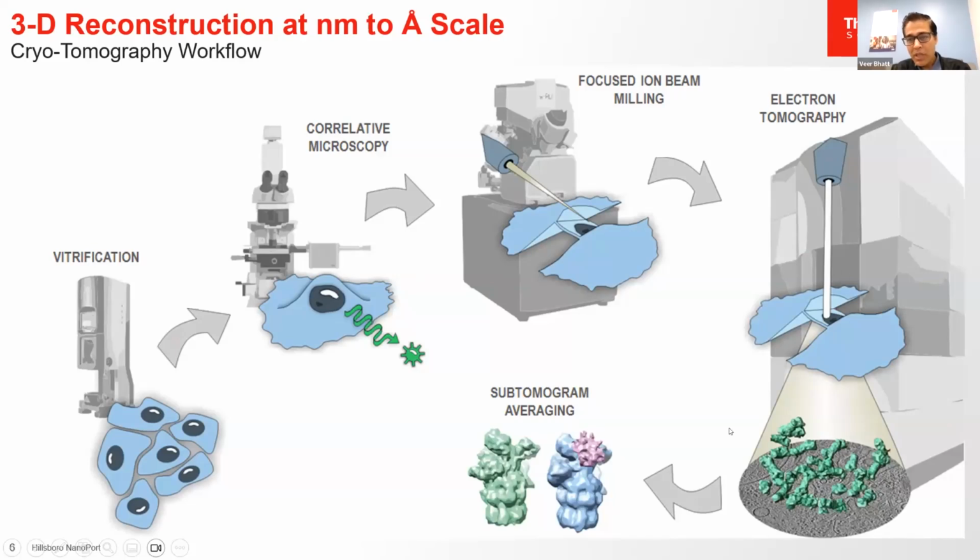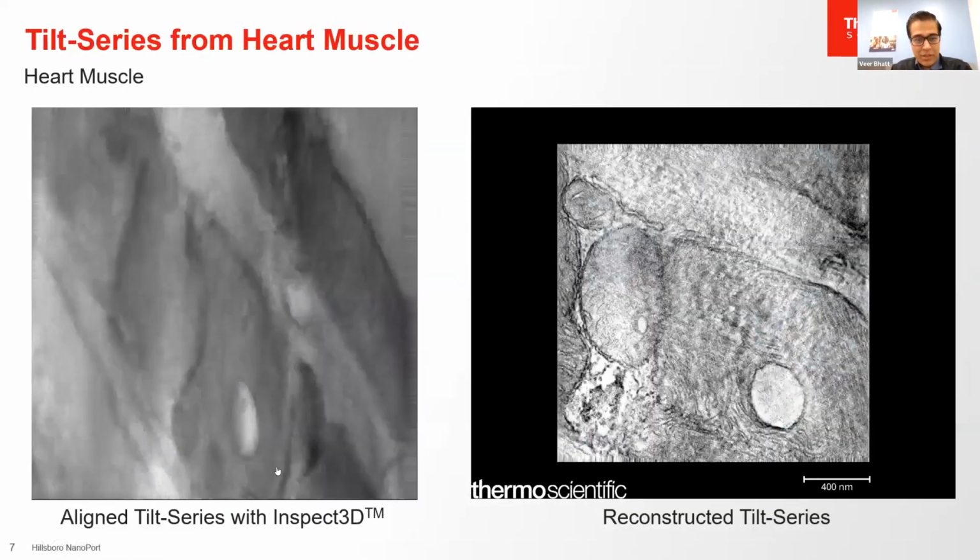And we can also extend, in many cases, the resolution by using subtomogram averaging workflows.